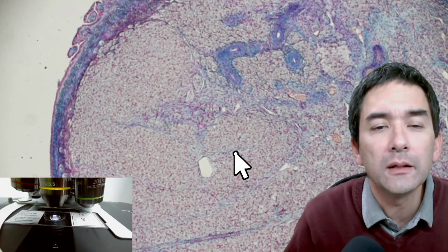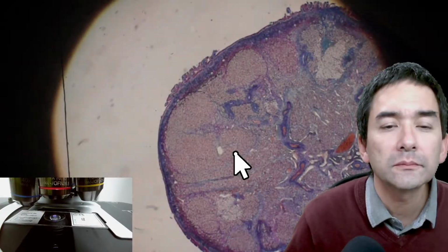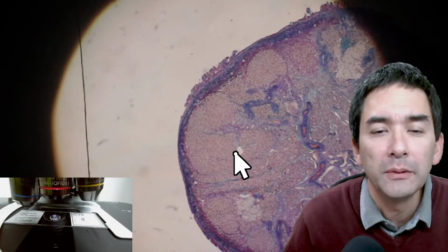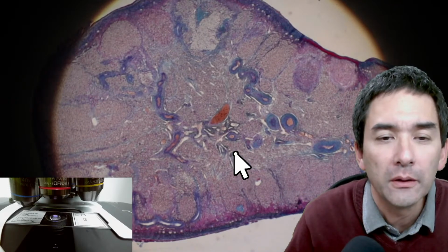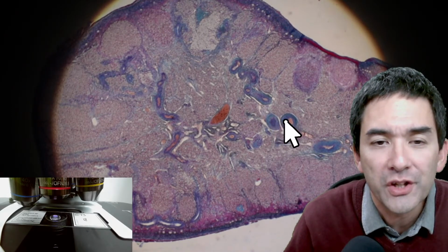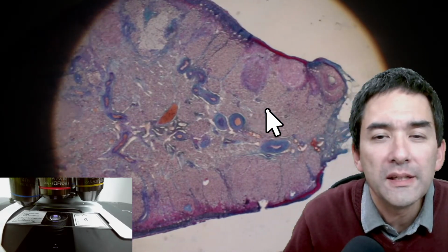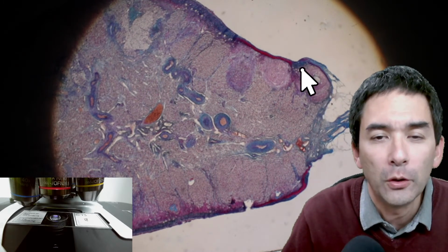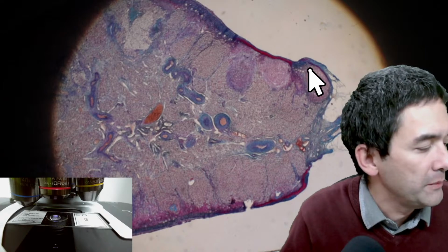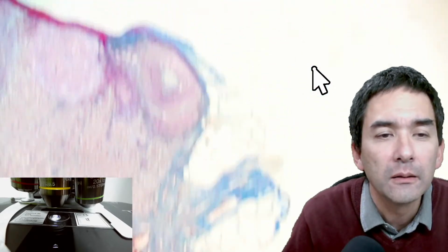What we're able to see again in the ovary. Okay, so this is basically the complete structure. In a human, of course, the ovary is significantly larger. A few things are already quite familiar. You see those round structures here, cross sections of blood vessels, which we already know. And then what you normally see is bubbles, and it could be that this is one of them, and those bubbles are the follicles. Let's just assume that this is one of them here. And inside the follicle, you have the egg cell ripening.